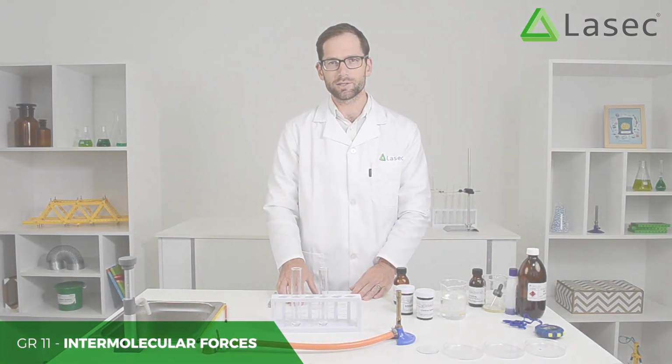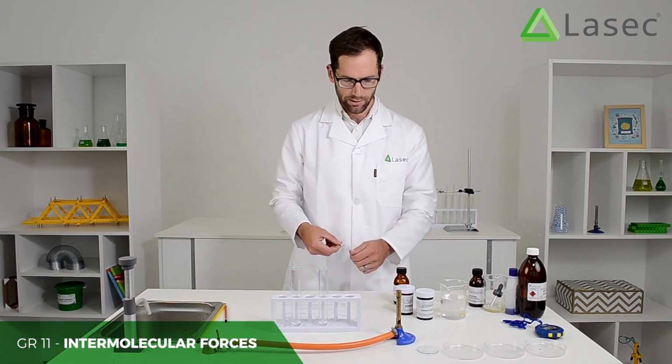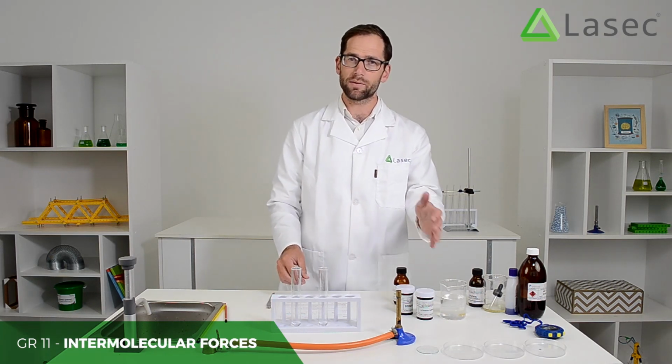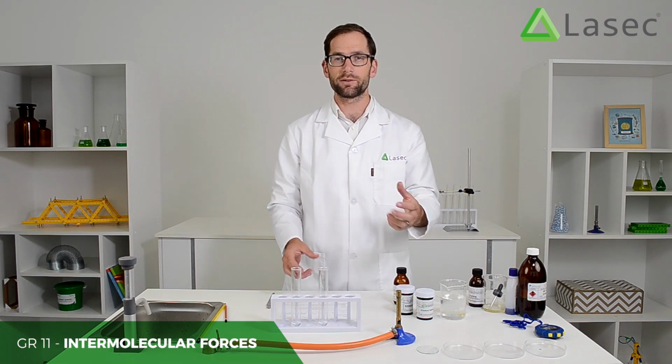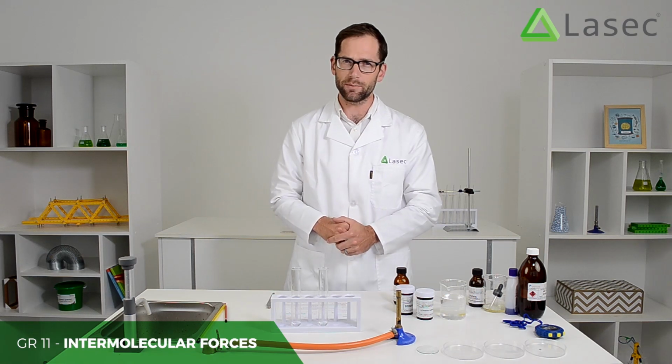So now we're taking a look at solubility, and what we're going to do is just take the tip of a spatula of sodium chloride, of potassium permanganate, and if you have available iodine crystals. Just keep in mind with iodine crystals, that's very volatile, and even if it's closed, it'll probably stain everything in your kit brown.